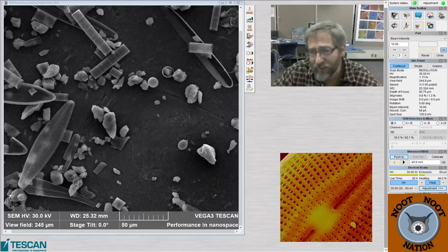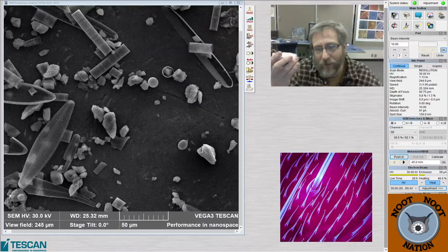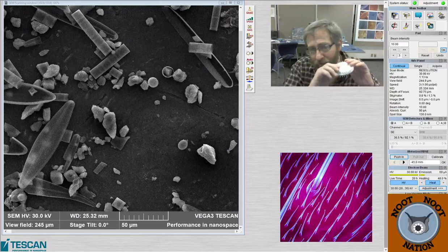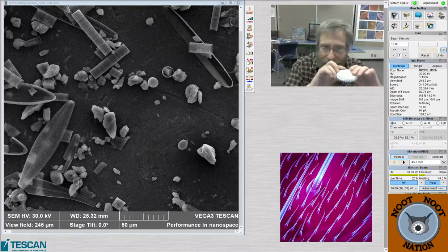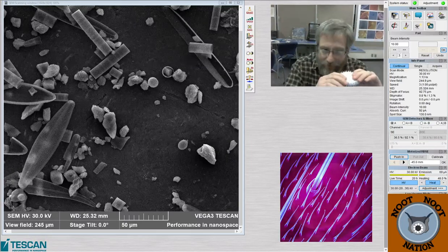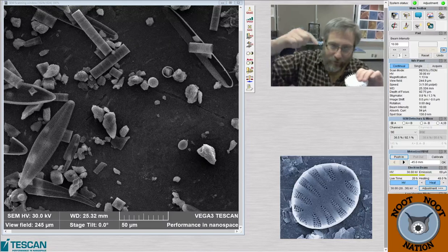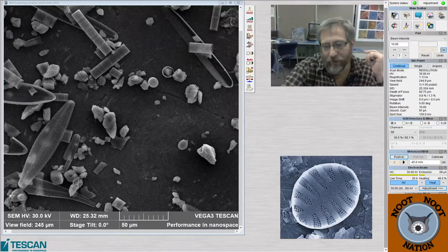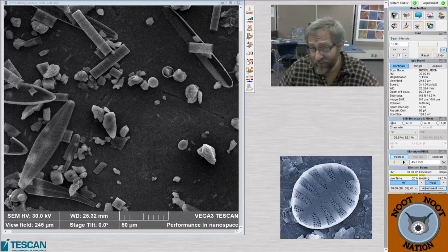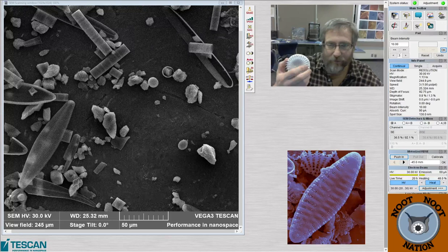We could make 3D models doing it with anything that's in here. It's just really, really time consuming. So for this model that we made from images, I spent 5 minutes on each picture. So it's 5 minutes, then rotate it 10 degrees or 20 degrees or whatever you want, and then take another picture and rotate it again. You have to go all the way around, and then make rings at different tilt values. I think I spent like 3 days taking pictures. But the details on the model are really impressive.